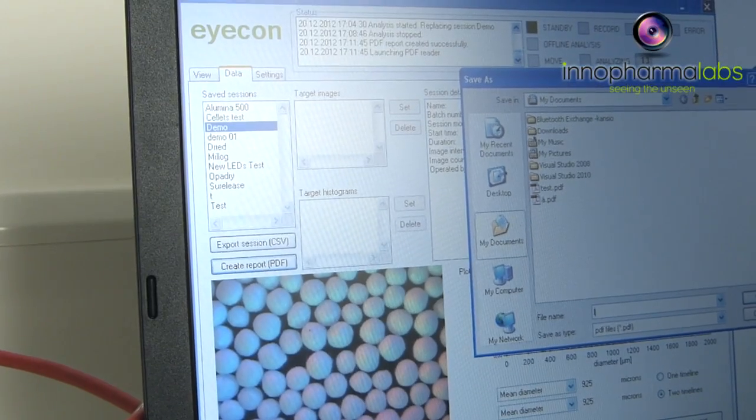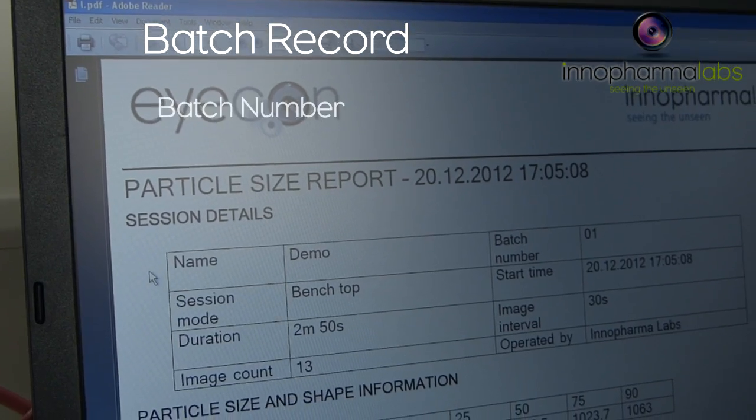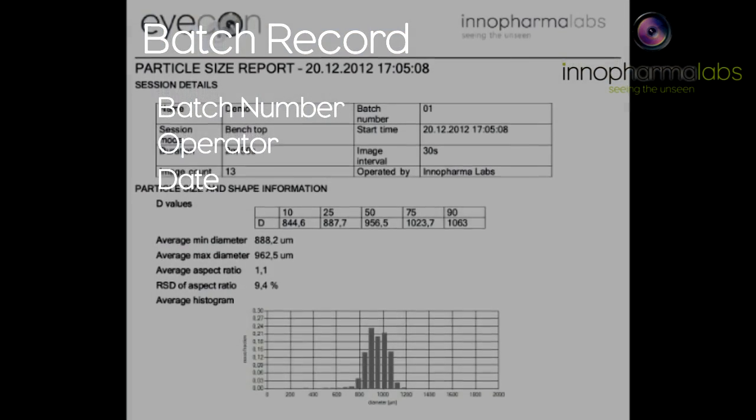A batch record for this measurement run can be produced. This record shows information on the run such as the batch number, operator and date.